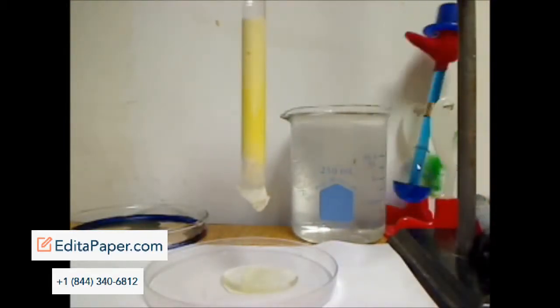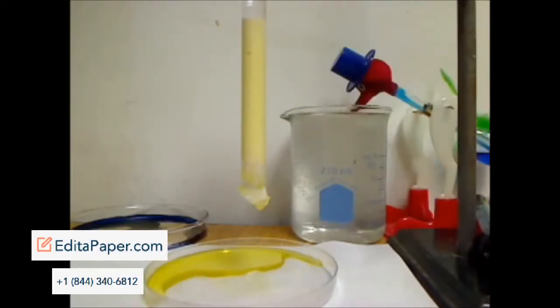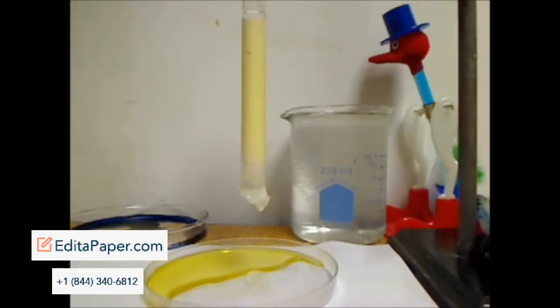Excellent. You can see the yellow colour fading and the acetone's taking out the yellow. Column chromatography can be used for bulk separation. That's its main usage.